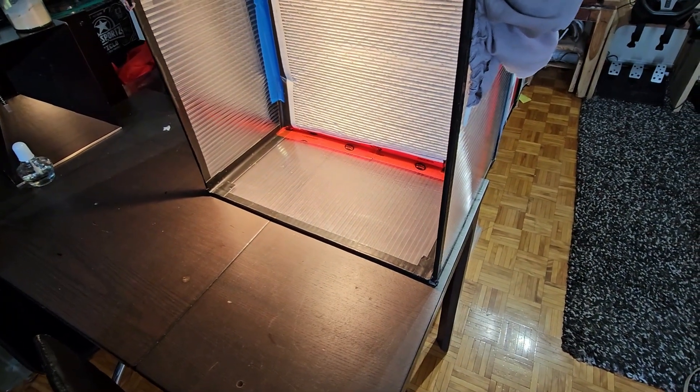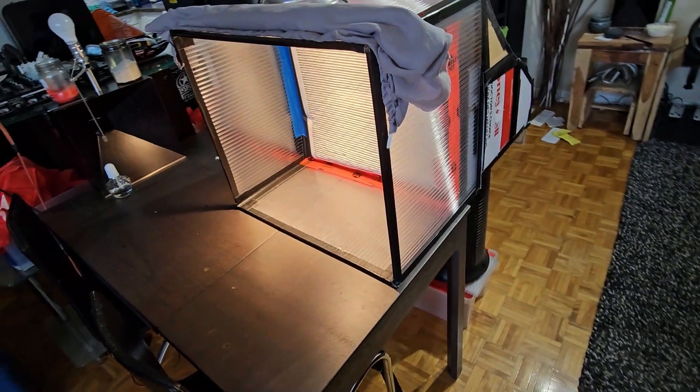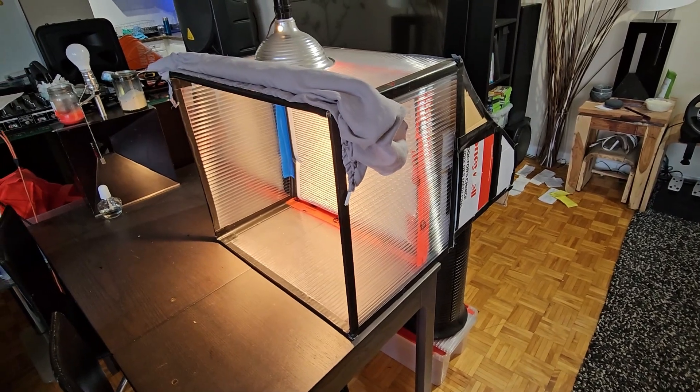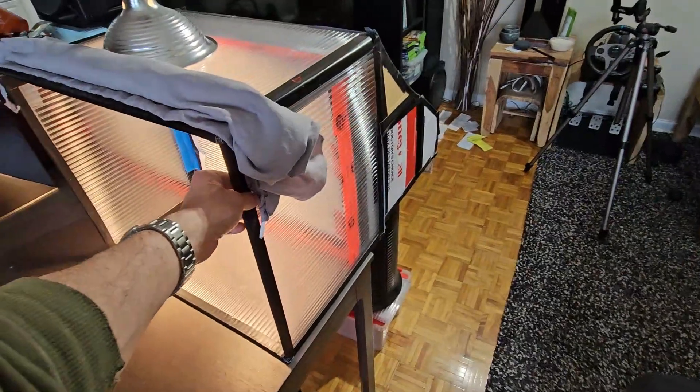About $350 for the unit and maybe about $50 worth of extra parts, so you've got an amazing two-foot by two-foot laminar flow hood for about $400, instead of the thousands of dollars that they cost online.